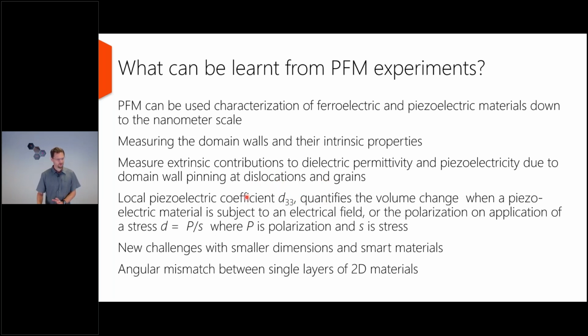And for quantification, you can try to determine the piezoelectric coefficient D33, in this case with units picometers per volt, quantifying the volume change when a piezoelectric material is subject to an electrical field, along with its polarization.